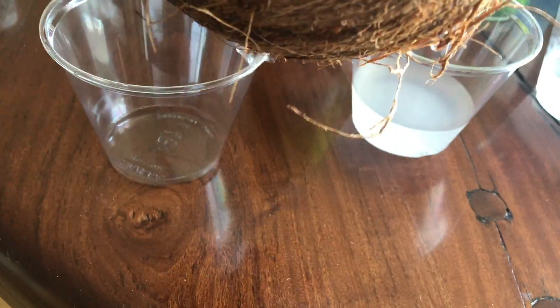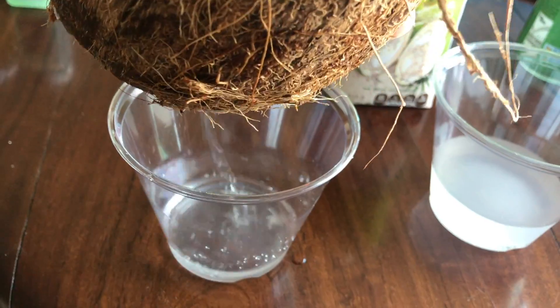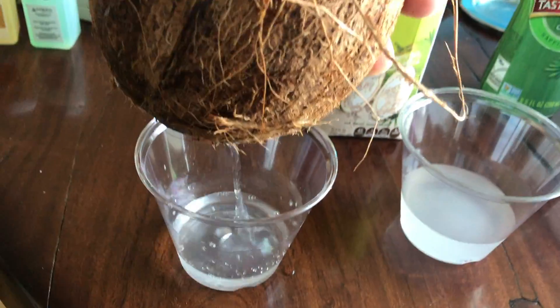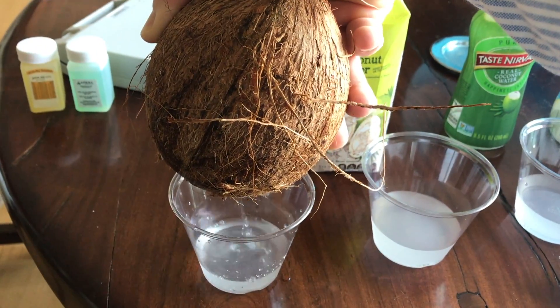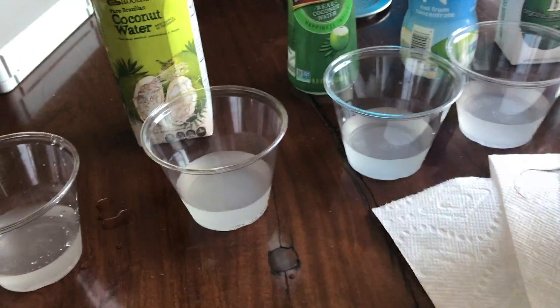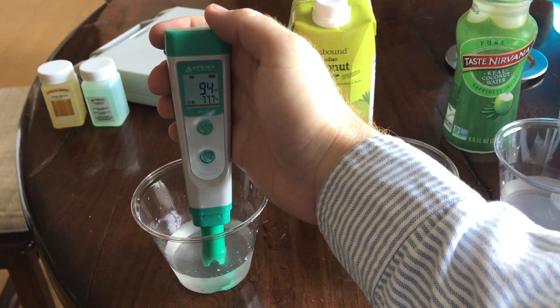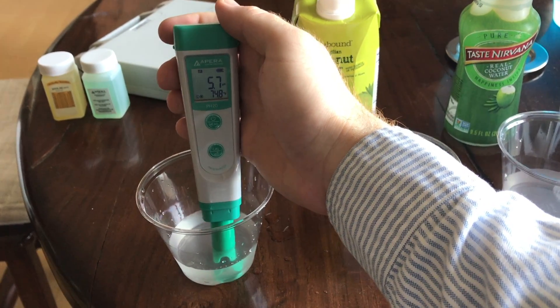So the point of this video is to compare the pH of real coconut water versus bottled coconut water. Let me pour out this fresh coconut water. An easy trick to get the water out of a coconut is to use a wine opener to go right through the eyes of the coconut, and then it makes an easy pour. I will be testing the pH of all these different coconut waters using an electronic pH meter.